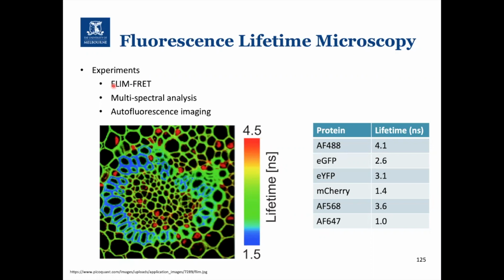Some experiments you can use it for are FRET applications, things like multispectral analysis, or even just autofluorescence imaging as well. So this is autofluorescence within a plant tissue.